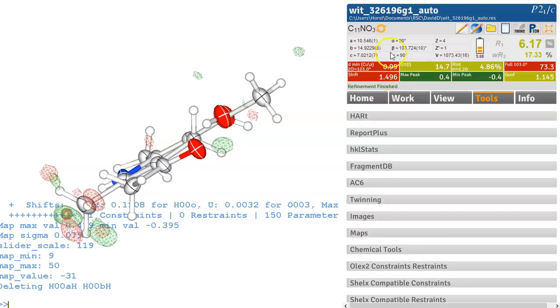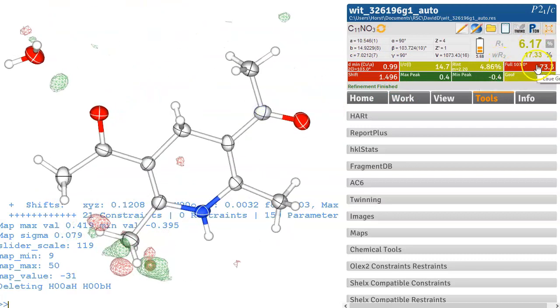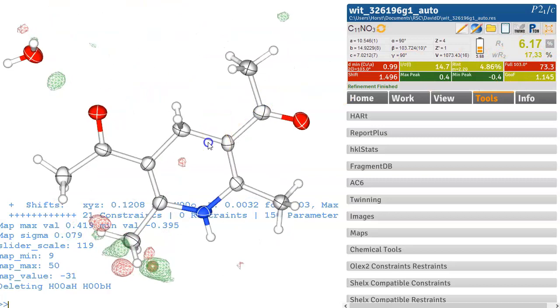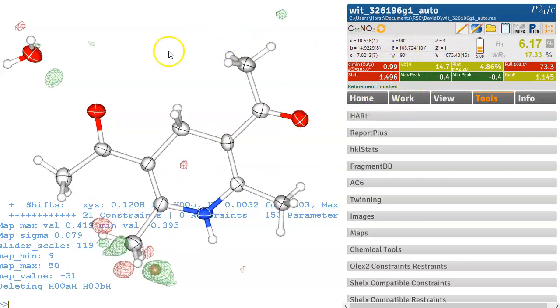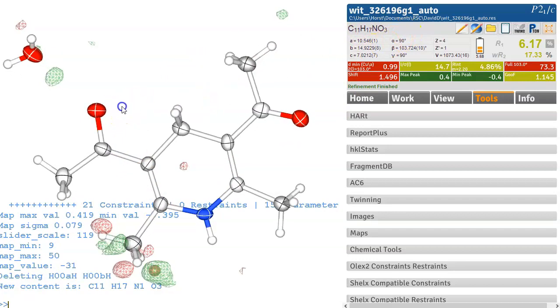So this is all still red so this one will always stay red because the resolution is just very low this one will always stay red because the completeness is very low but the rest of it we should be able to deal with so this one tells us okay something is not quite right with that formula because we added the other hydrogen so we click on that and that updates the formula to what's on the screen.